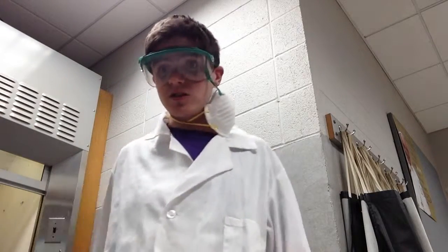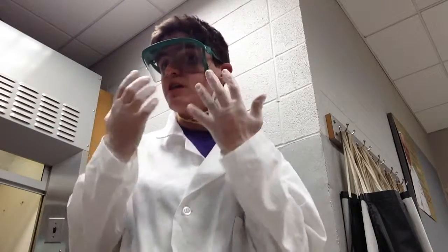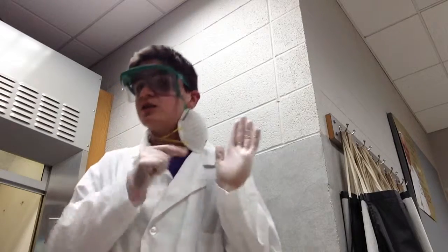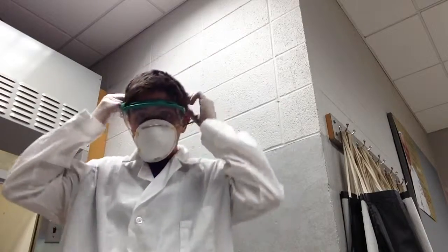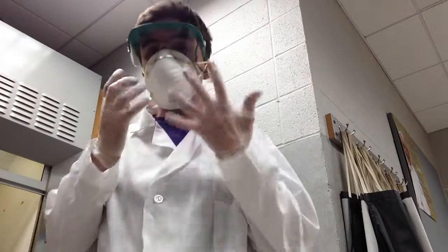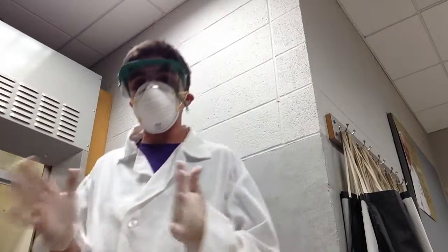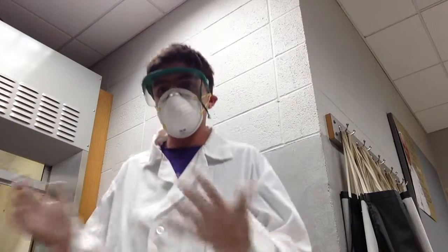I've got my safety goggles on because I do not want aluminum in my eyes. I've got gloves on so I don't get the powder on my skin and accidentally later touch my face or eat food or whatever. Actually, this stuff is so nasty, I'm going to wear a face mask. So if you'll excuse me, I need this to make sure that the particles don't get into me at all. I want to be as safe as I can around this chemical. And that's one of the reasons why we do this as a demonstration instead of as a lab.